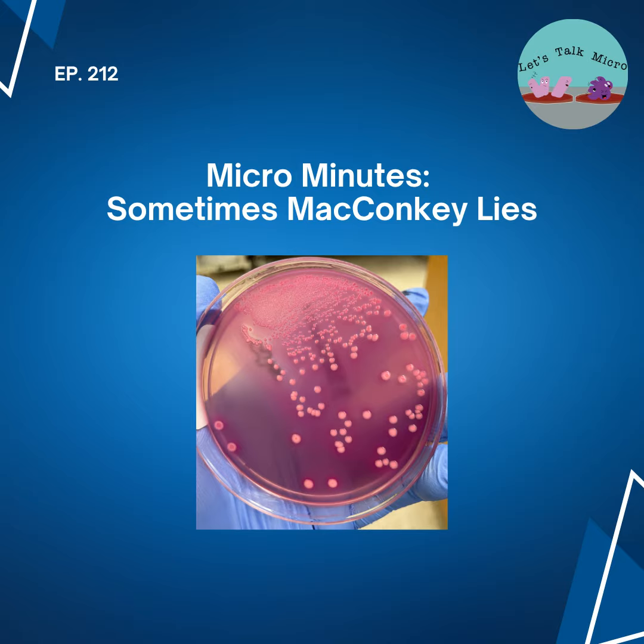So from all this, there are two takeaways. No growth on MacConkey does not rule out a gram-negative rod, and growth on MacConkey does not always equal bacteria.